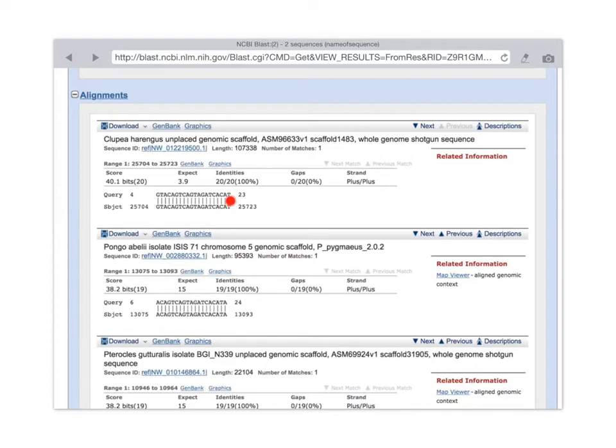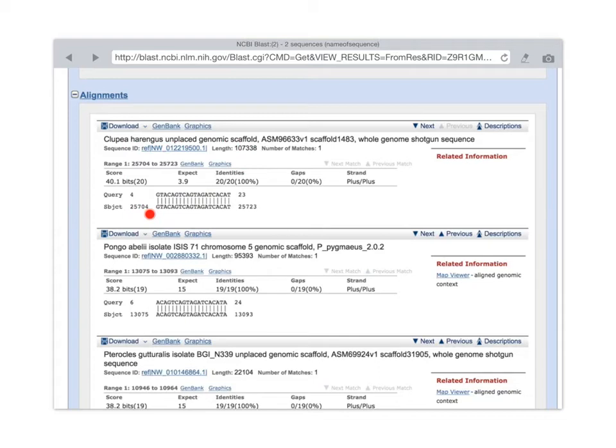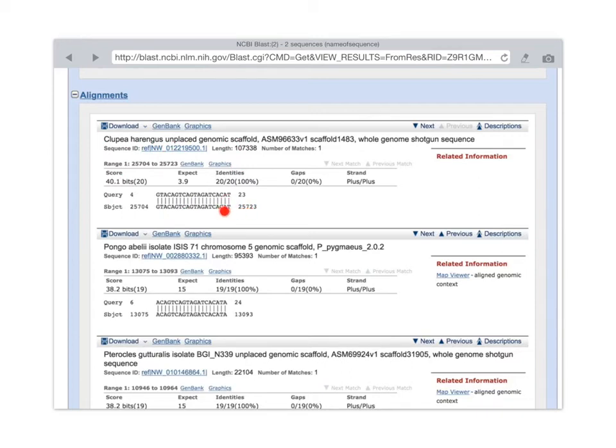And so we have query sequence matching from position 4 to position 23, or nucleotide 4 to 23, matches the subject sequence, which is, again, the Clupea harengus genome sequence. From position 25,704, that's the position of that first G, to position 25,723, which is the position in the genome sequence of that last T.